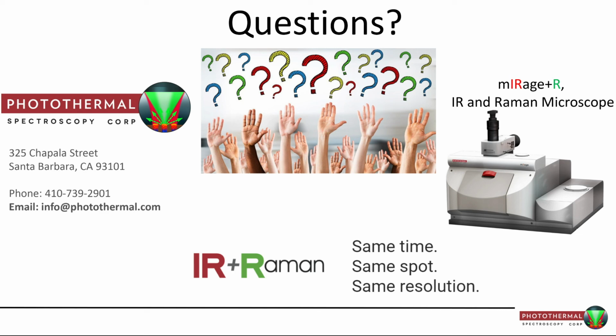Okay, thank you. This next question I'll take. This one I think came in when I was talking about detectors. What detectors are used, and do you need liquid nitrogen cooling? So that's another common question I get. In traditional FTIR instruments, especially the microscopy instruments, and probably the microscope you used on the synchrotron, use liquid nitrogen cooled infrared detectors, and you need that liquid nitrogen cooling to increase the sensitivity for infrared measurements. But the key thing to remember with this sort of system is that once the sample is excited by the infrared laser, everything else in the system is done in the optical region.